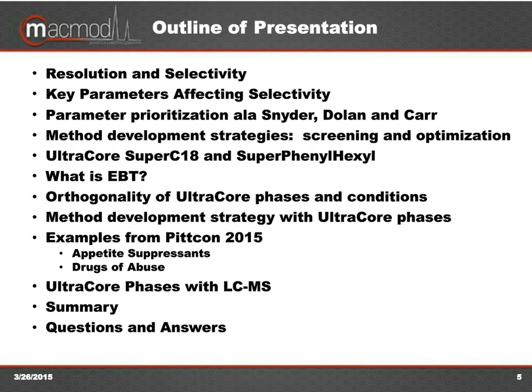And then I'll show some real-world examples from my PittCon 2015 talk, including 2 different samples in method development for appetite suppressants as well as for drugs of abuse. I'll briefly show a couple of the new applications on Ultra Core phases, in particular one on LCMS. I'll conclude with a summary, and then we'll take your questions, and hopefully I can provide some good answers for you.